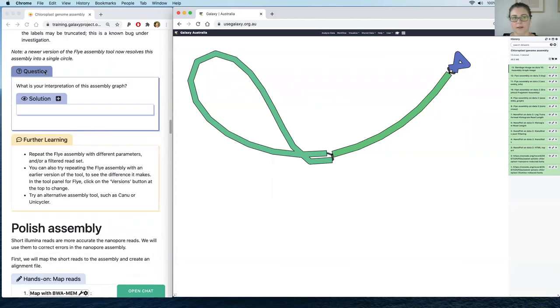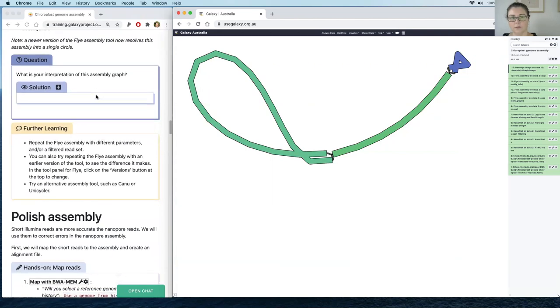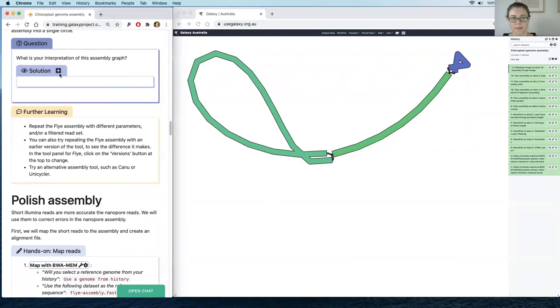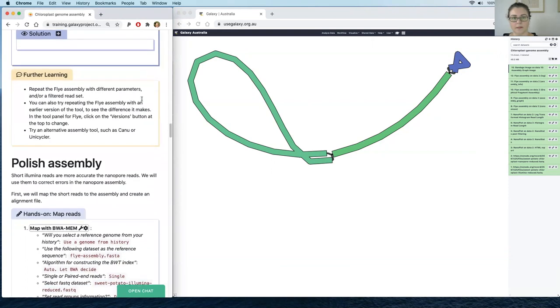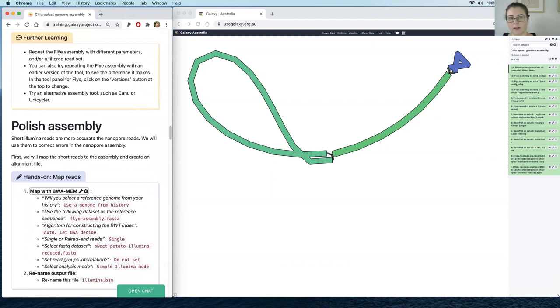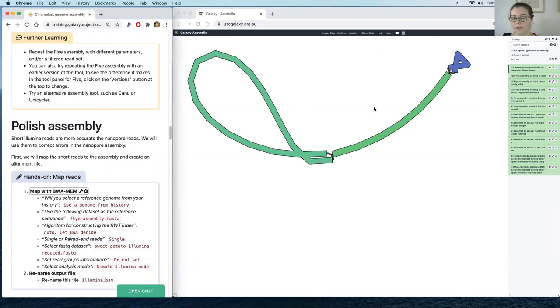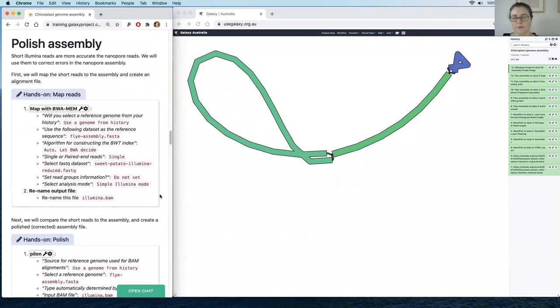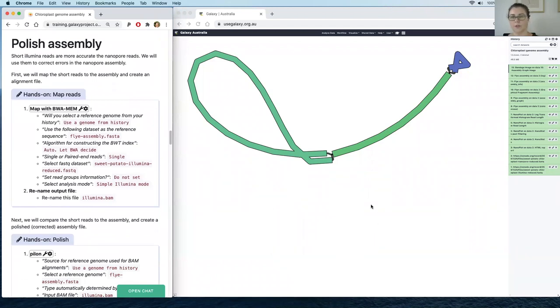There's more discussion about that in the question and solution section in the tutorial. This was just one tool — we've run Flye — but you can repeat this with different versions of Flye. Sometimes newer versions will assemble the reads into a single circular chromosome. You can also try different assembly tools such as Canu or Unicycler. Now let's polish that assembly. Because we have a set of short reads, we can use those to correct some of the errors that might be in our long read assembly, since long reads typically have a higher error rate than the shorter Illumina reads.